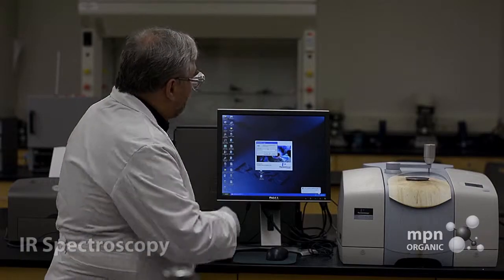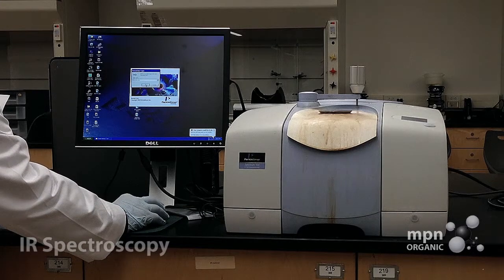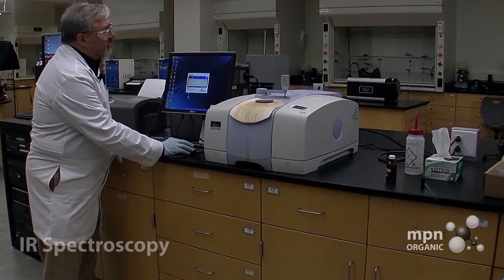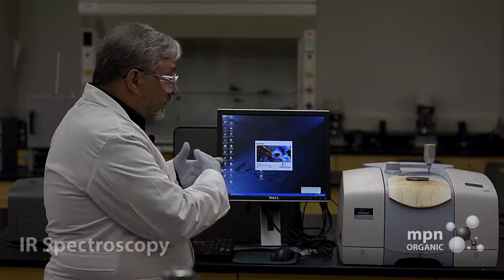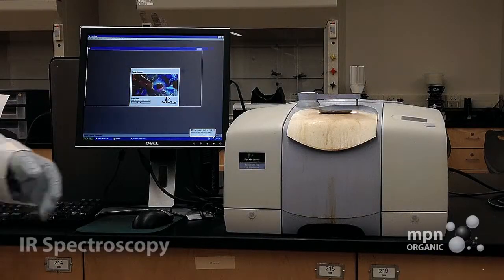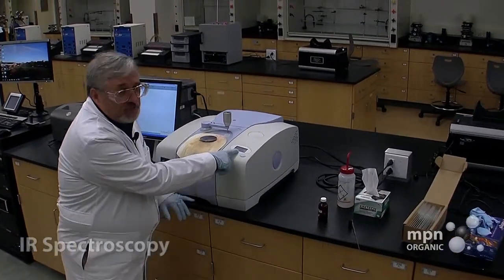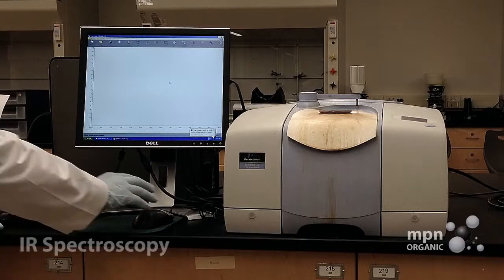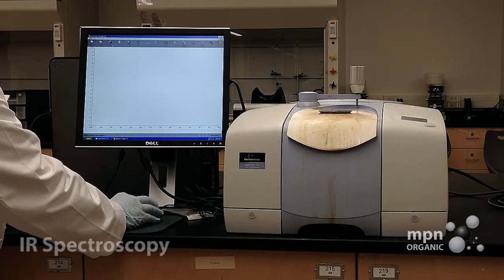There, okay. And we come to this, and it's going to ask you a couple of questions, and you're going to say, yes, I'm the administrator, okay. And no, I'm not going to use the active IR assistant. Okay, and then it's going to come to the screen, which is going to record our infrared spectrum. Now, over in this window here, it will say ready. You cannot take an infrared spectrum if it doesn't say ready. All right? Okay, here's our screen, and there are some icons here at the top which we're going to use for giving us an infrared spectrum.